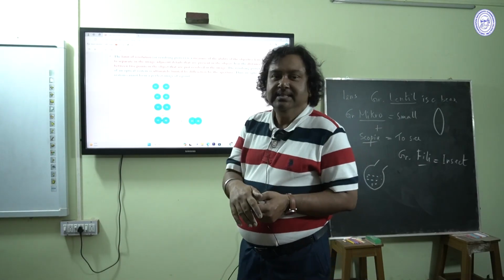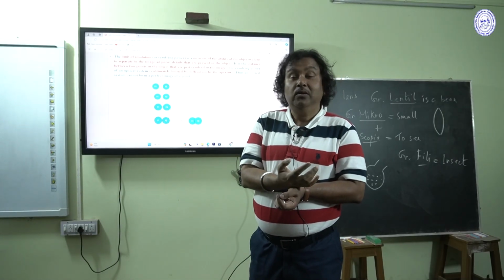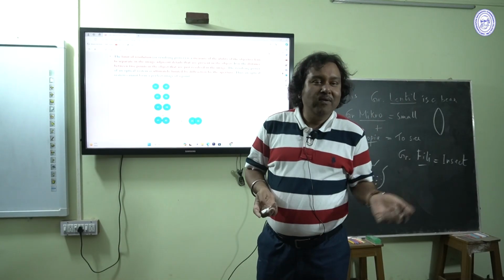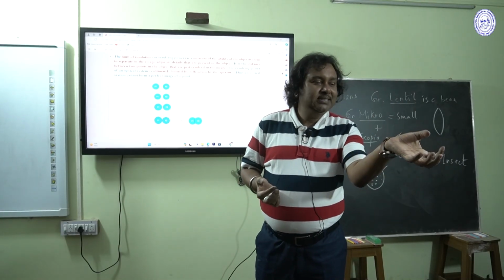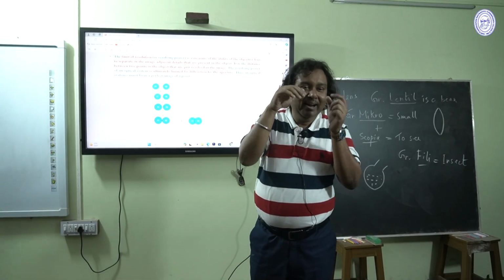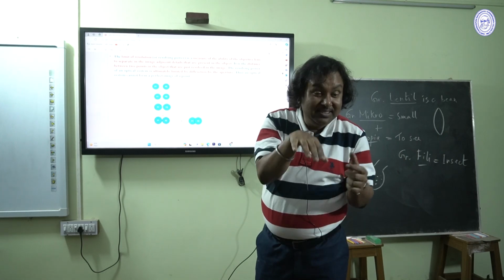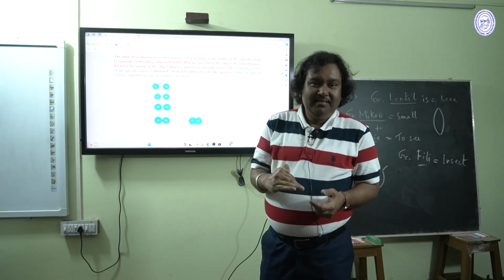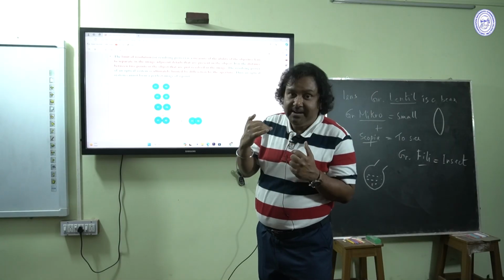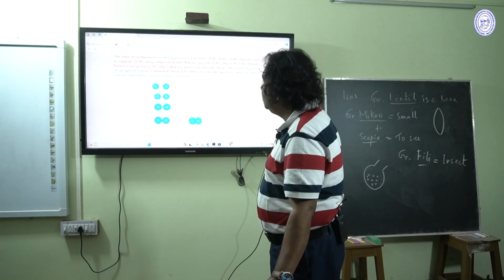The basic question is, when should we use a microscope? To see a mango tree, or a building, or human beings, or small organisms like ants, we don't need a microscope, because our naked eye is able to resolve these objects. So our eye has some limitations. What is the limitation? This is simply known as the limit of resolution.